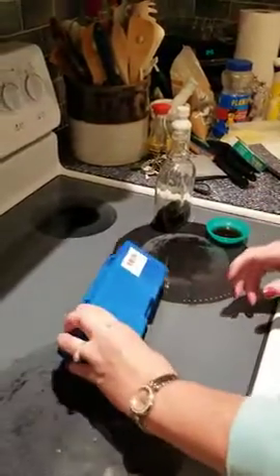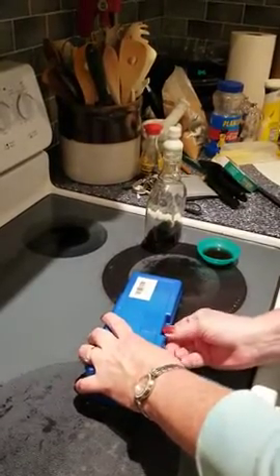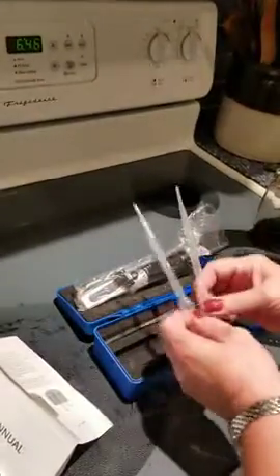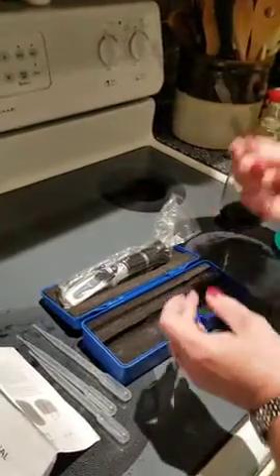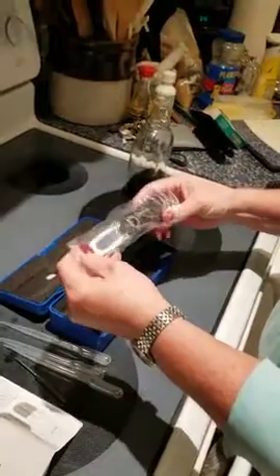I bought this refractometer from Smart Smith on Amazon and we're just gonna open up. Under here we have the user's manual. It came with three droppers, nicely packaged with foam in the case to keep it from bouncing around. You have a screwdriver for calibration. We're gonna give it a try and see how it works.